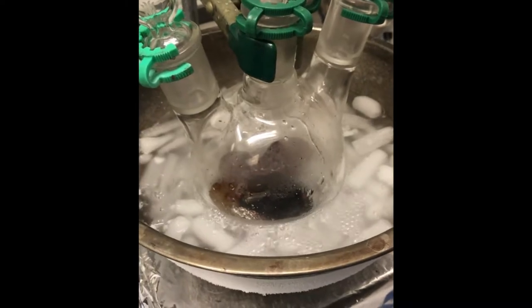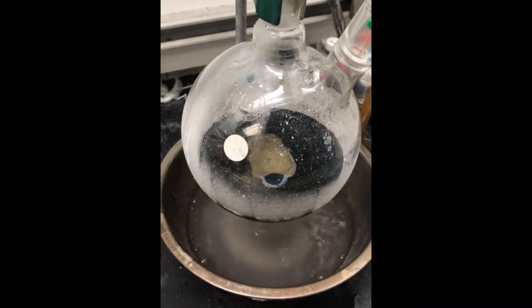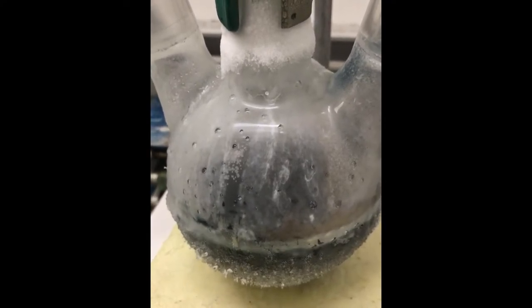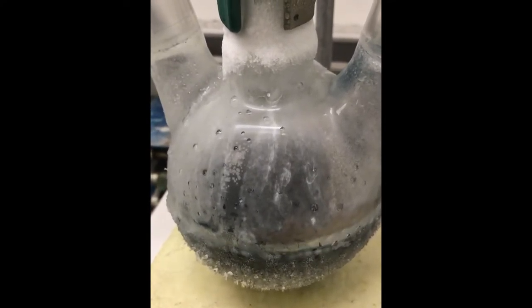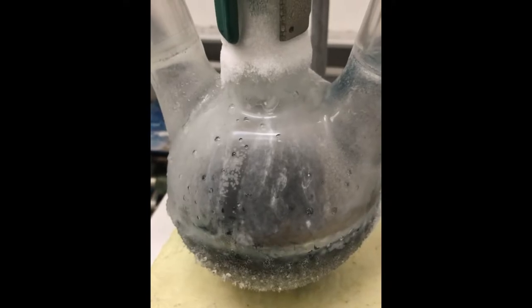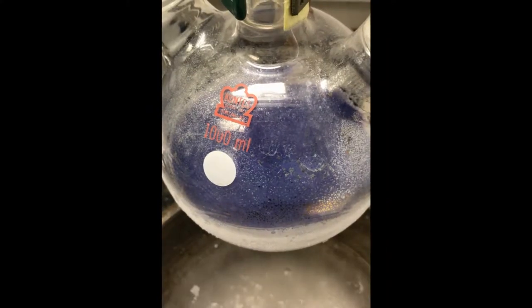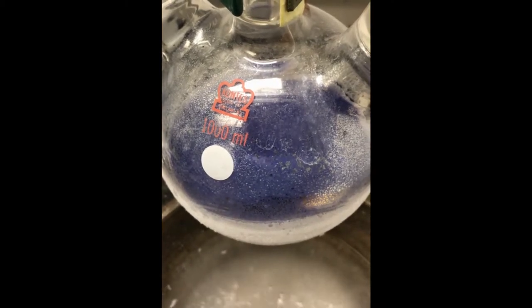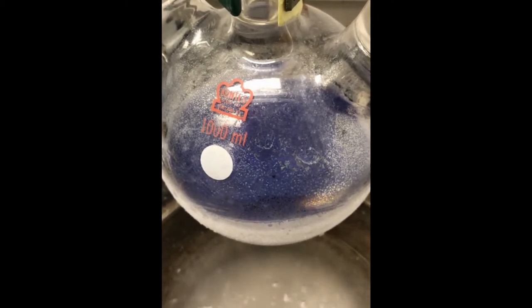We have a setup where we dissolve alkali metals in liquid ammonia and slowly add our chalcogenide. These materials react pretty vigorously, so we have to keep the whole setup at dry ice temperatures so that we can make starting materials for our reactions.